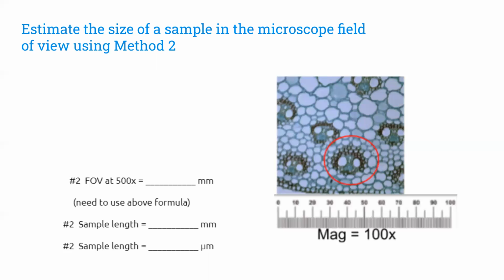Sorry, that's a high power. I lied. Okay. How many circles? So I was busy with the microscope. So my question is, did you guys make your circles as big as the red circle? About 2.5. Okay. So I realized it's kind of confusing on my part because really what I wanted you to do is just this part right here. But if you did the big red circle, you're still doing the right process. So it's more about the process.